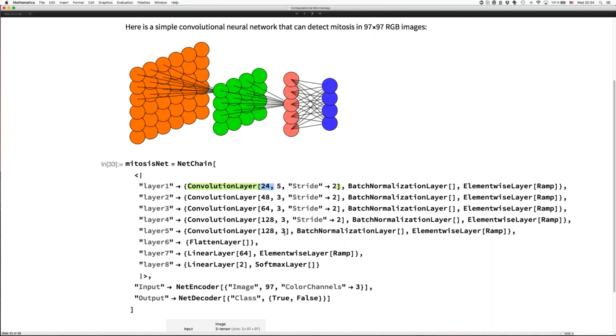And just by trial and error, you get a feel of what works, because essentially what determines the structure or the number of layers is not the network, it's the data. It's pretty much just like fitting a function. I mean, there's no right or wrong function to fit. It has to be the right function for the data at hand. And that's the answer to that question.